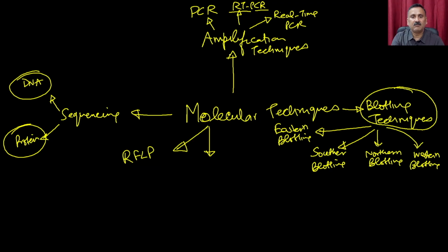So, what we are going to do is, within this molecular techniques topic, we are going to discuss the amplification techniques, because they also have downstream applications in molecular cloning, and then we are also going to discuss the blotting techniques.